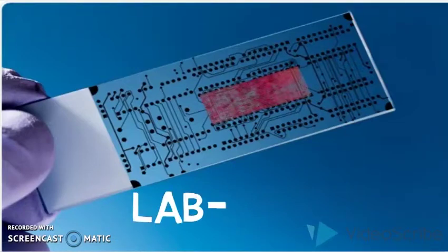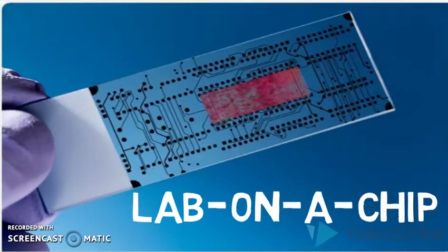All of us have heard about glucose meters, but do you know what principle they work on? Oh, no, I don't. It works on the concept of a lab on a chip. Is it? What is that? So let's understand the working principle behind them.